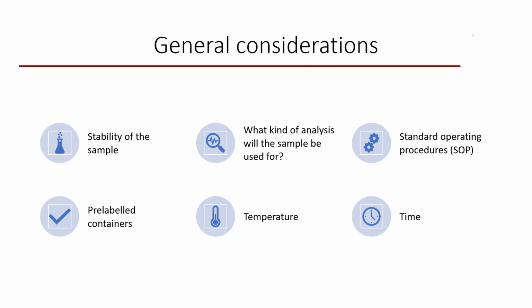It's important with pre-labeled containers, especially if you're dealing with samples taken in the clinics where the sampler might be a physician who takes the samples during surgery, and then it's very important that the samples are put in a good container and make it clear where everything belongs. The temperature is important, as well as the time.